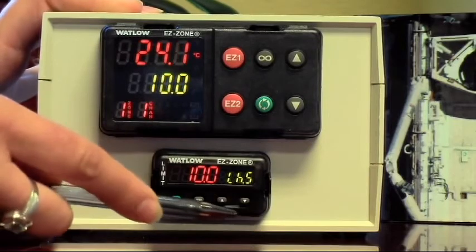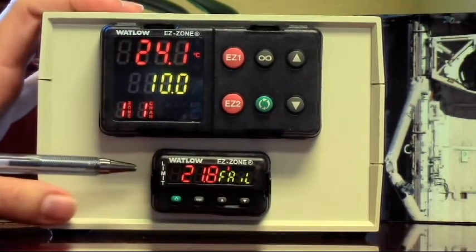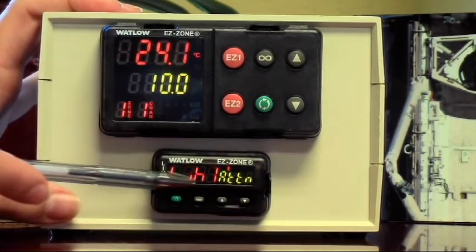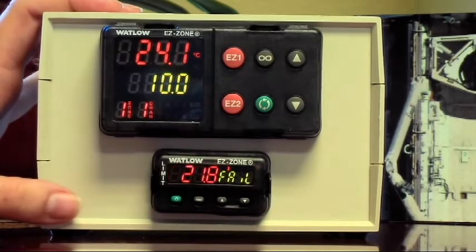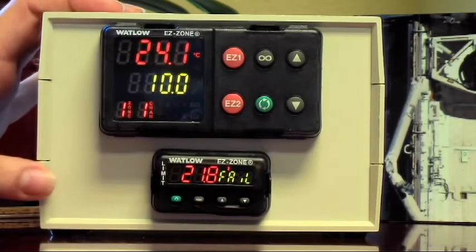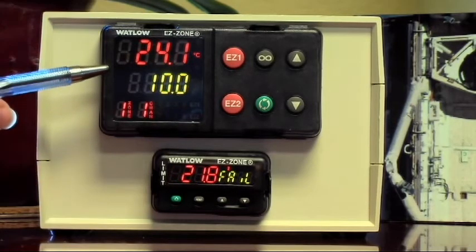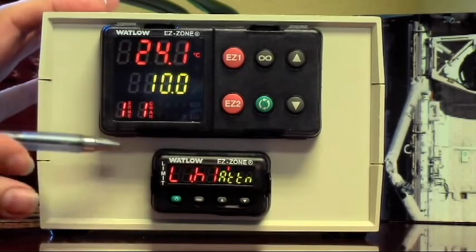I'm going to press the green button and use the down arrow to go down to 10, then press Reset to trigger an alarm condition. The display now shows 'fail, attention.' Number two lit up when that happened, and that number two is cutting off power to the heaters. So if you were supposed to set your controller at 115 and accidentally set it at 150, if the high limit is set properly, it's going to stop the oven from heating.